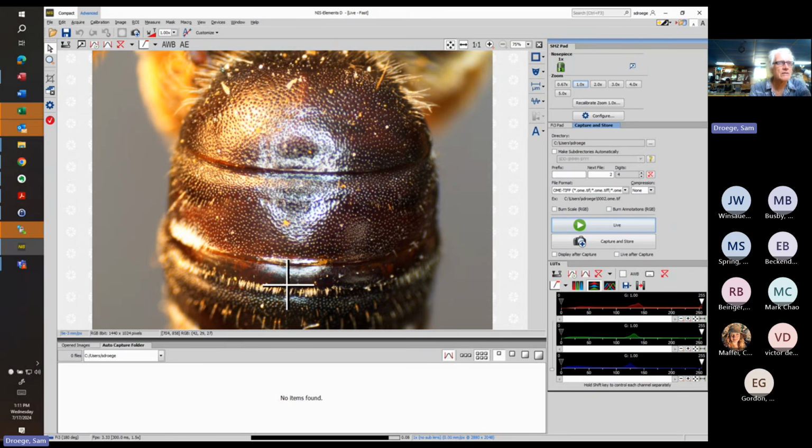and all these other segments, they can expand and contract underneath the previous segment in different ways. So for example, if we go down here to T3, this is pretty clearly the rim of T2. Remember these things go under each other. So T3 is under T2, but this area right here is probably a portion of the abdomen T3 segment that is more pulled out than normal. So we don't see that up here. You don't see this bare area and this fringe, a little bit of hair is maybe peeking out.